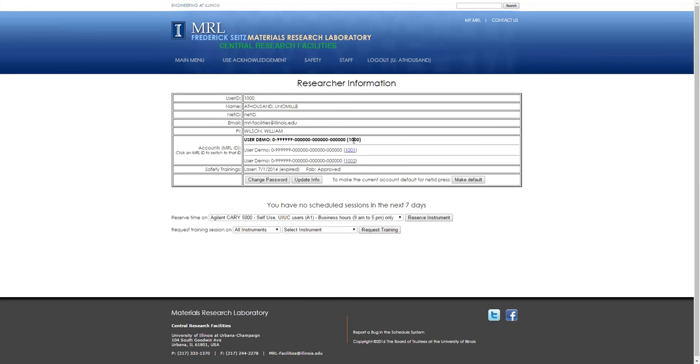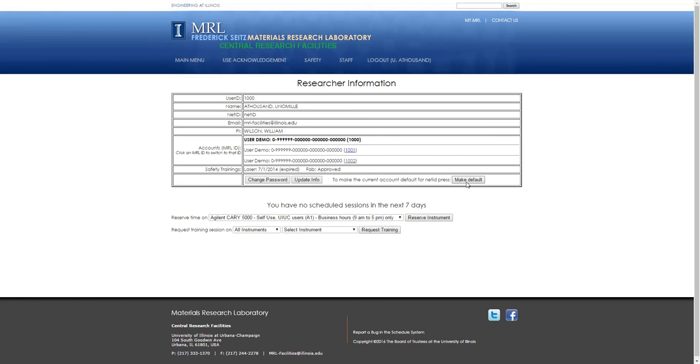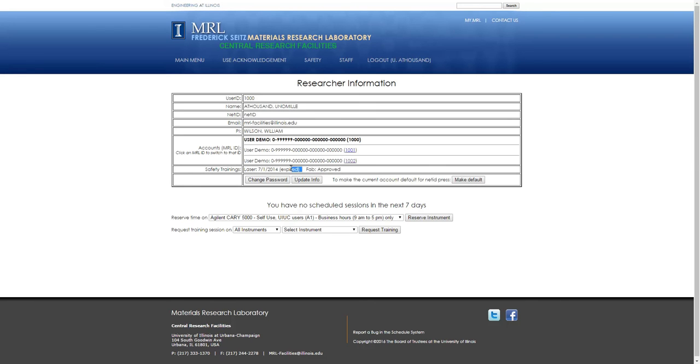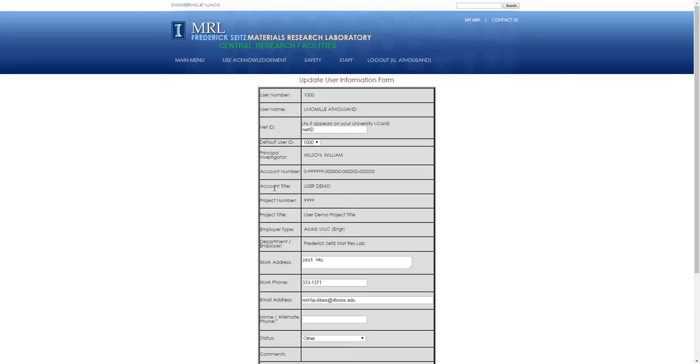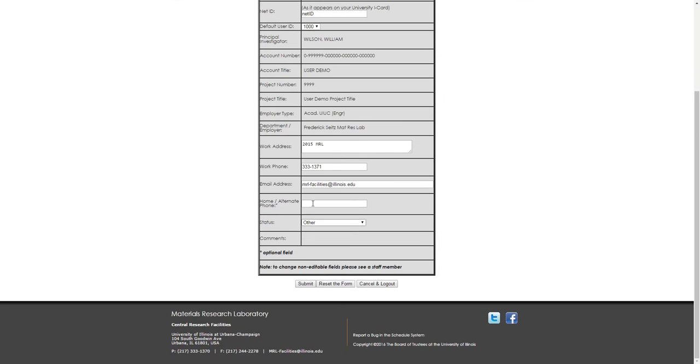You can switch to these different accounts, and you can choose which one to make default when you sign in with your NetID. The safety trainings listed here are only going to apply if you have these approvals or if you ever had, so this will say if your laser safety training is expired. You can change your password or change things like your work address or your preferred email address.